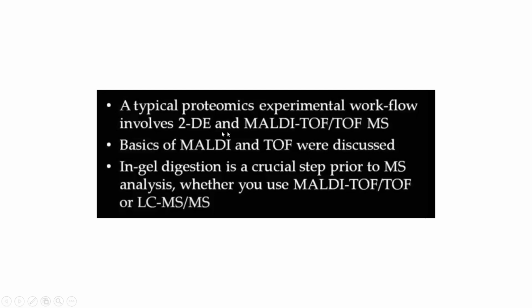So the general workflow is 2D and then MALDI-TOF. We just discussed MALDI here, and whether you use MALDI-TOF or LC-MS-MS, in-gel digestion is a crucial step, because that is the one which will tell you what type of peptides are formed in your sample.